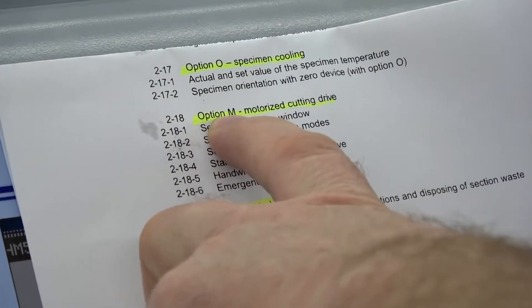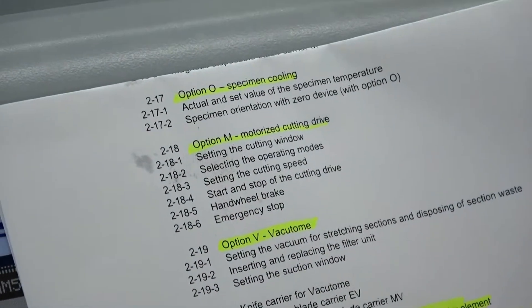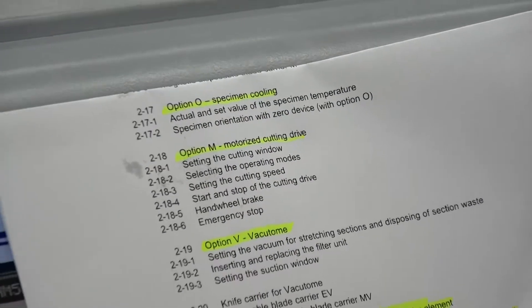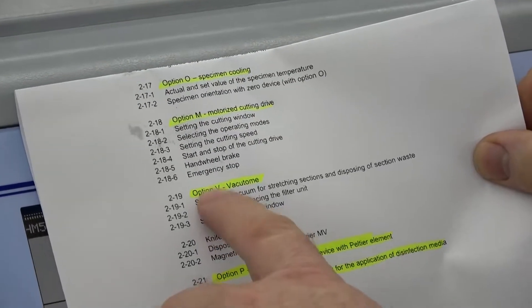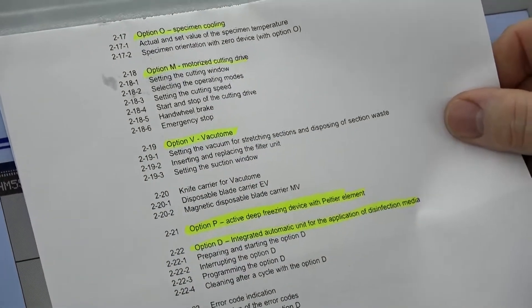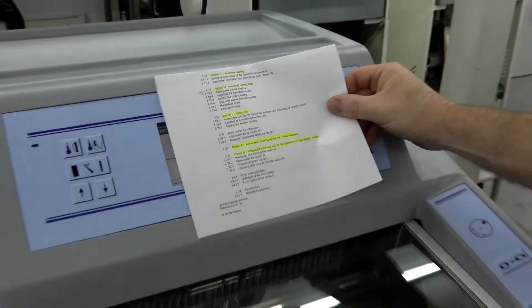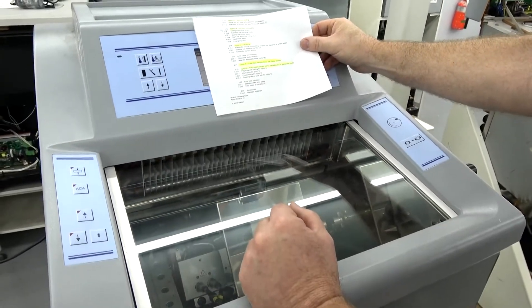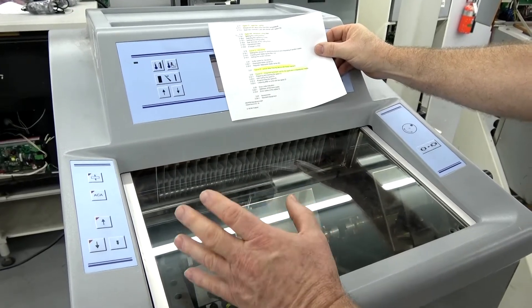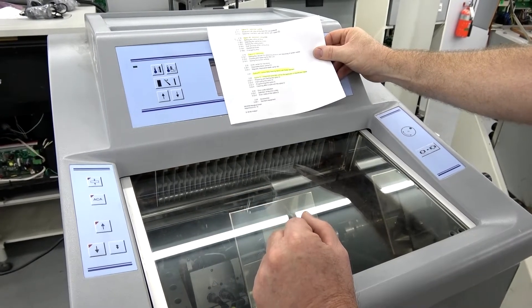Option M is the motorized cutting drive. This machine does not have that option either — there's no automatic motor, you're just manually cranking the handle. Then we have Option V, and that's the vacuum tome. That's the one I was talking about — this machine does have the vacuum tome. I've talked to customers that don't even know what a vacuum tome is. You can shut that option off if you don't want to use it, but if you aren't using it, why let the vacuum motor run and waste energy?